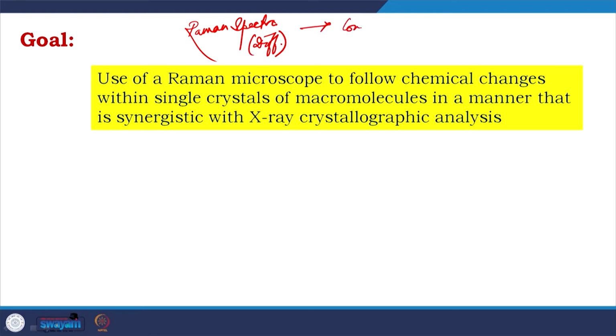We are using confocal, so that we lock in Z of the crystal. We are using the protein crystal as a platform of the experimental setup. So, Raman spectroscopy, confocal and crystallography combined, we name this unique technique Raman crystallography.